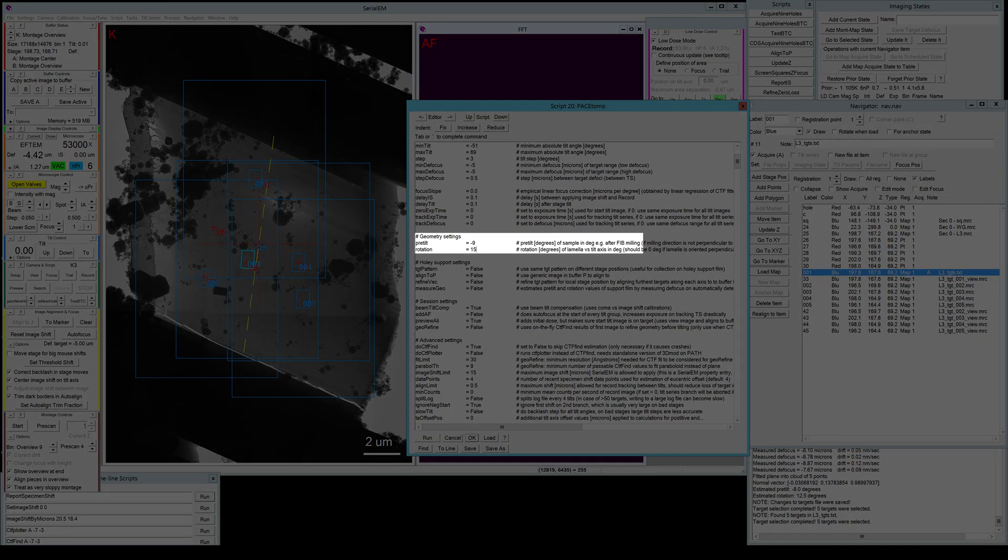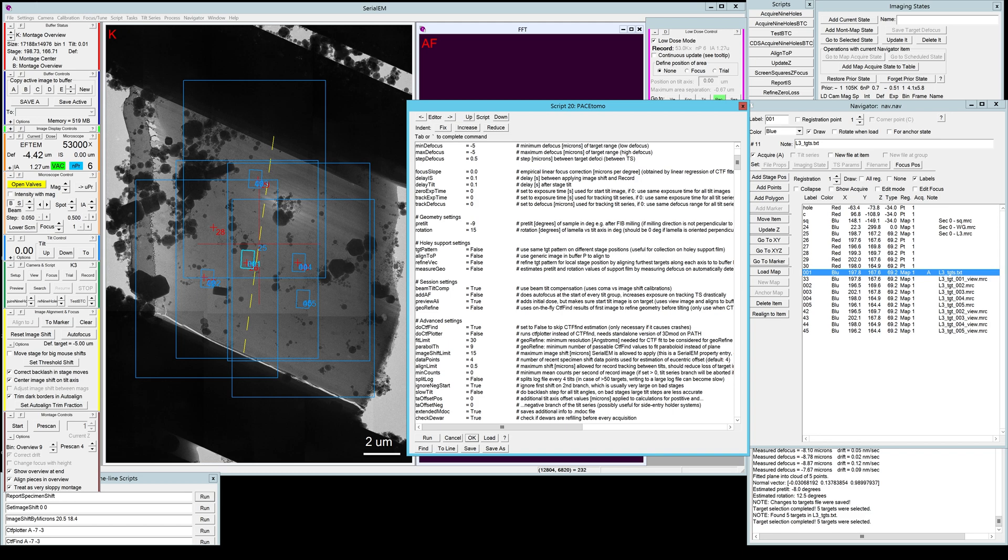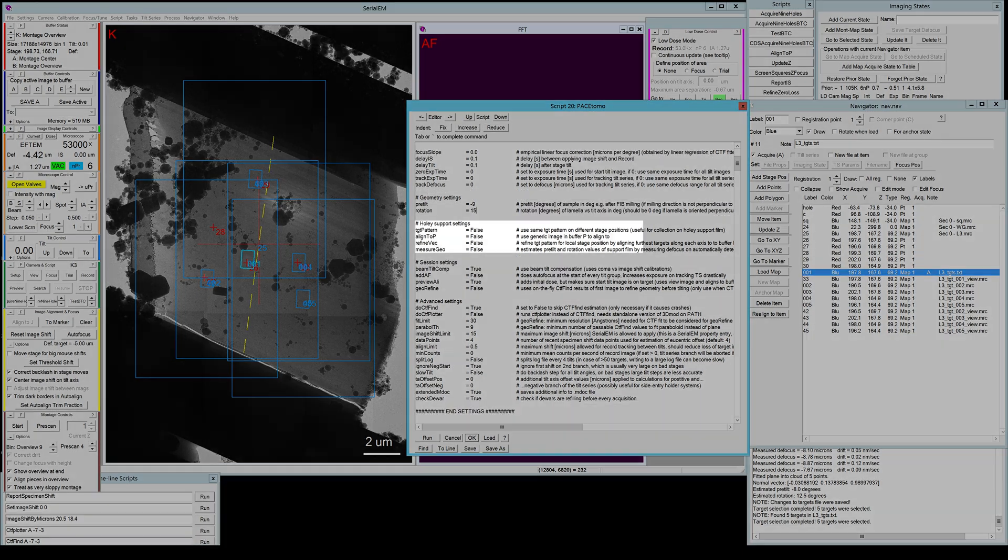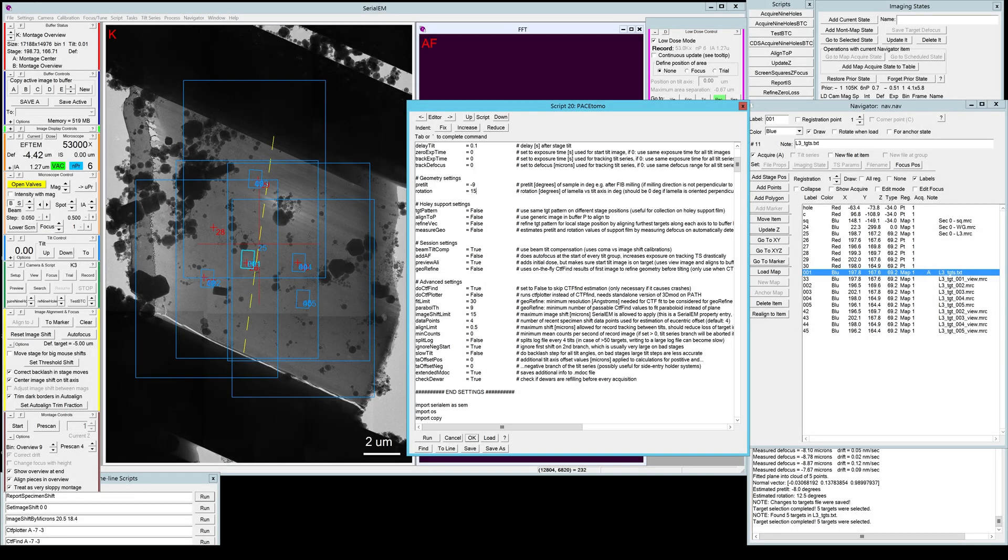If you saw earlier the target selection, you know that you can actually measure these values more precisely. So I only put them rough in here, and then I do measure them precisely for every target area separately in the select target script. The next settings are only relevant for holey support films, and I'll talk more about them in a separate video.